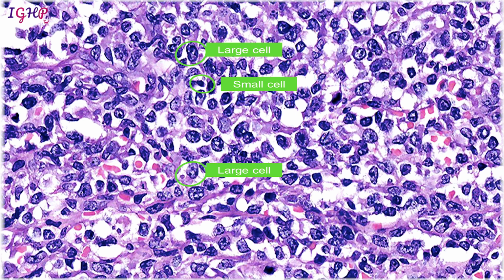you're going to look for these things, and you're going to find them everywhere in all your slides: the lymphocytes. So go and hunt for these small lymphocytes, and when you find one lymphocyte, you compare the rest of the things with this lymphocyte, and then you will be able to tell whether the thing you are dealing with is small or large.